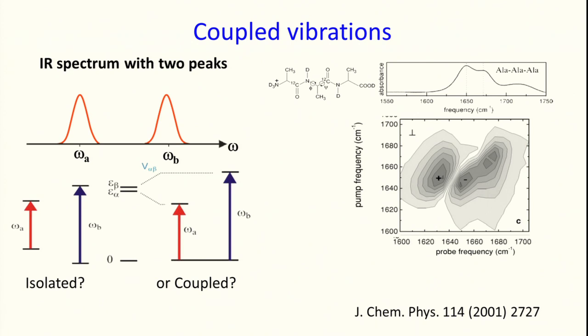showing you a 2D IR spectrum already, what you see is that this 2D IR spectrum is actually a 3 dimensional plot. On one axis we have pump frequency, on the other axis we have probe frequency. There is a third axis pointing out of the projection towards you or towards me. That axis gives you the intensity or absorbance, whatever you choose to plot.